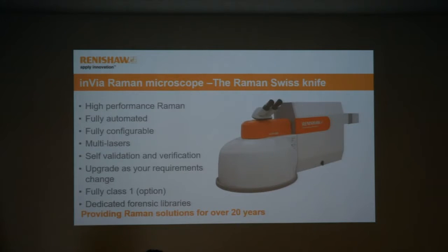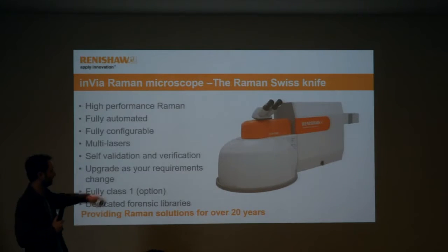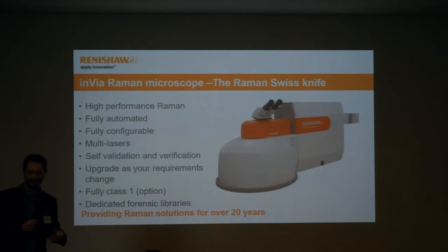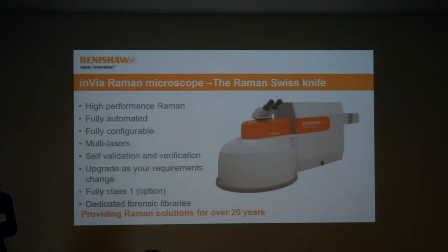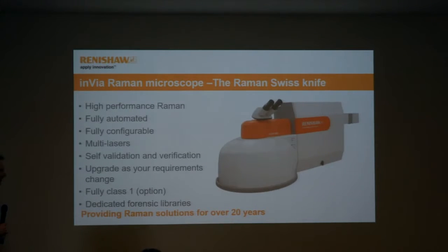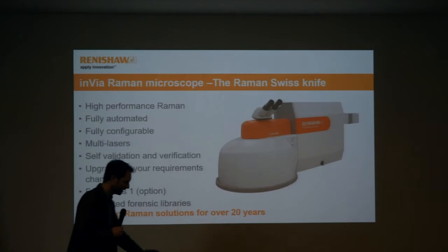It's fully class 1 if you want, so you have an enclosure around the microscope on the left-hand side. And it has dedicated forensics libraries. However, this remains an expert tool, so you need to know how to use it and what you're looking for. It can take a bit of time to grasp the use of it.